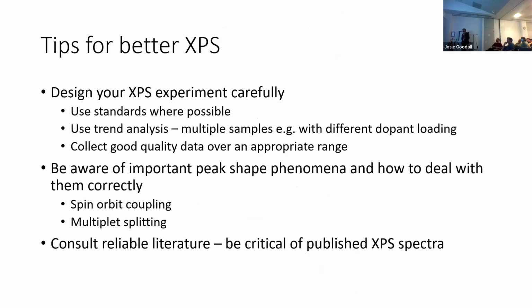Another one. Okay, so we've had a lot of tips for better XPS at each stage, but I'll try to make some of them here and do an overview. Something that can improve a lot of XPS practice is to design your XPS experiment carefully. Don't just shove it in and say, I want to know about these elements, and then I'll worry about the analysis afterwards. Think about how you're going to do the analysis. Think about what your research question is before you go to the spectrometer and record the data sets.